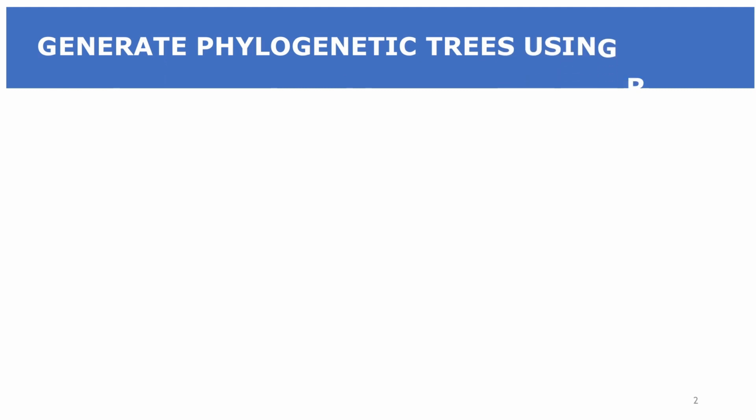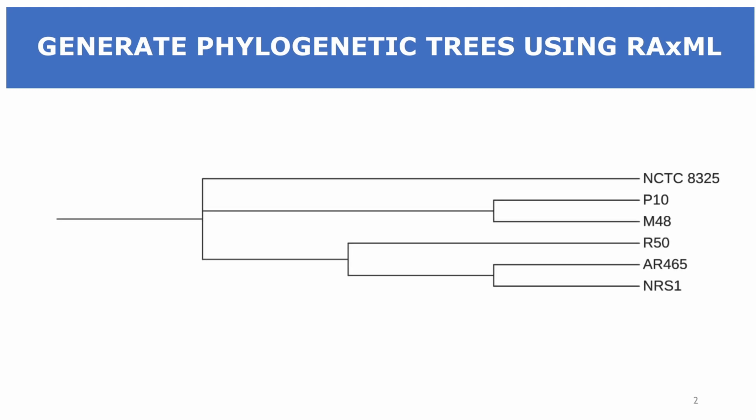Hello guys, welcome once again to another tutorial session in bioinformatics. In today's video, I am going to show you how you can generate phylogenetic trees using RAxML. By the end of this tutorial, you would have generated this cool phylogenetic tree using RAxML.